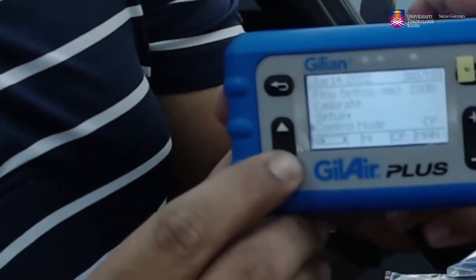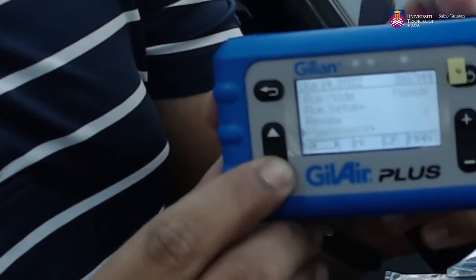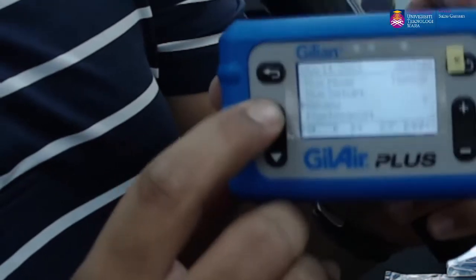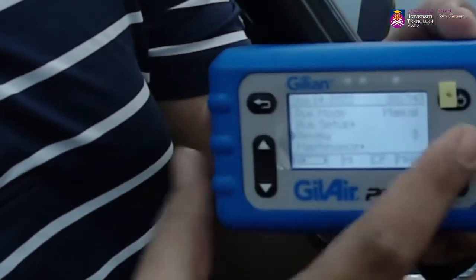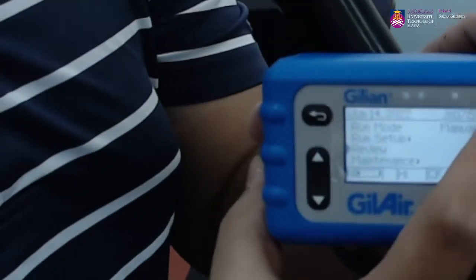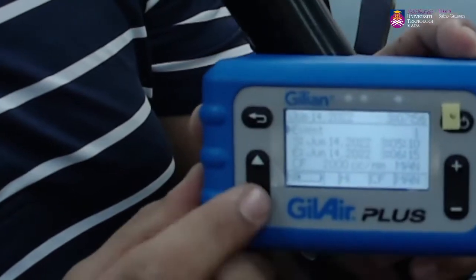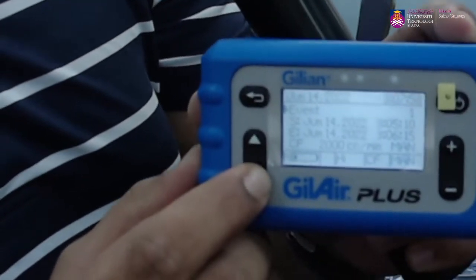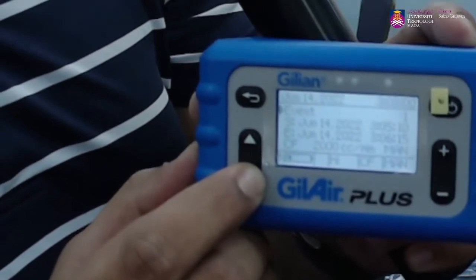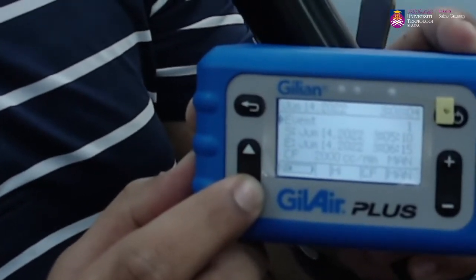Kita boleh go dekat bahagian review. Kita pergi tekan bahagian review. So far ada 3 lah. Means that ada yang pernah buat kot before this. Okay, so bila kita tekan enter kepada review, then kita boleh tengok in terms of berapa data yang kita dah ambil tadi. Contohnya event 1, dia tunjuk kita in terms of berapa runtime and berapa flow rate yang kita dah set lah.